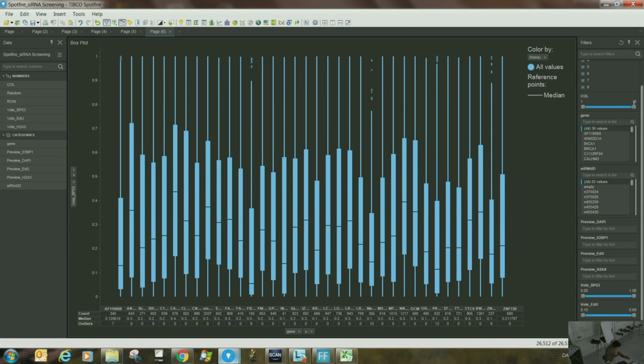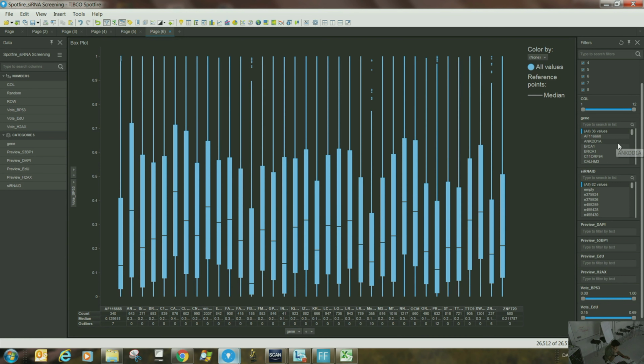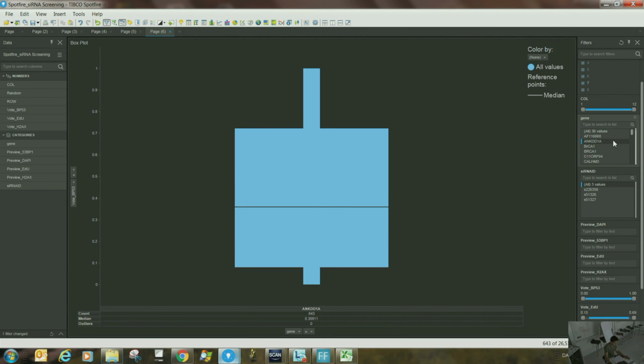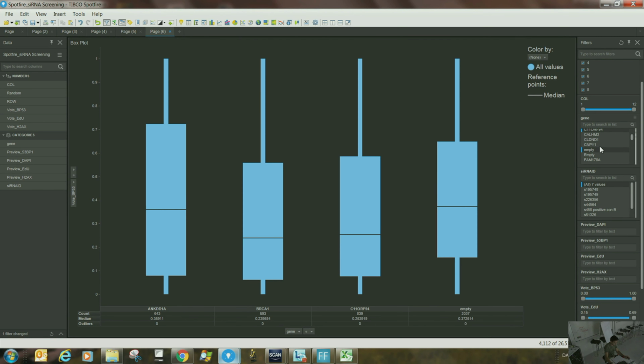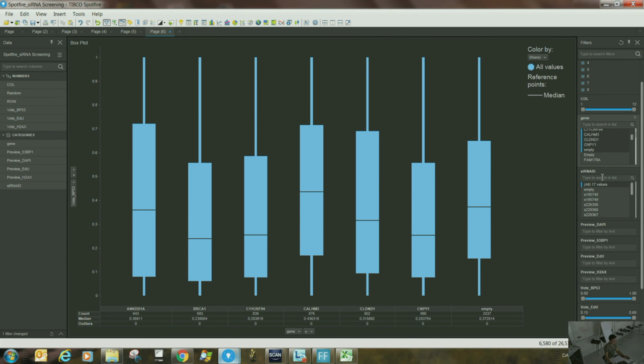genes. So maybe I'm not interested in all the genes that I want to compare, but maybe some of the genes. So if you just click here, control, put control. I think this should be now. Now it looks good actually, visualization. Imagine that your interest is only to compare these genes with each other with respect to 53BP1 foci.